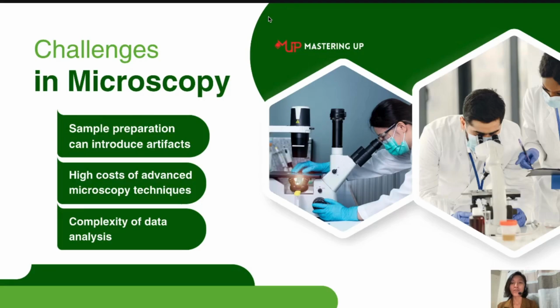Lastly is data overload. Sometimes microscopes produce so much data that it's hard to analyze all of it. This is especially true with high resolution techniques like super resolution microscopy, where we can get lots of images and need powerful computers to analyze them.